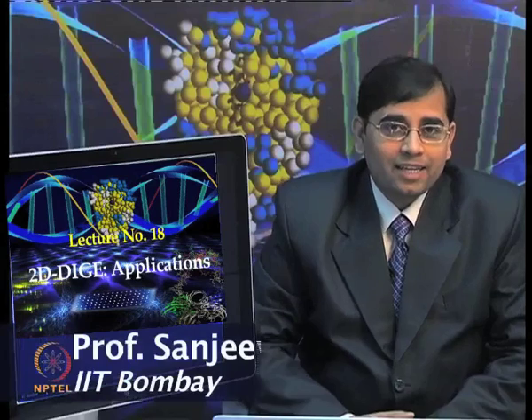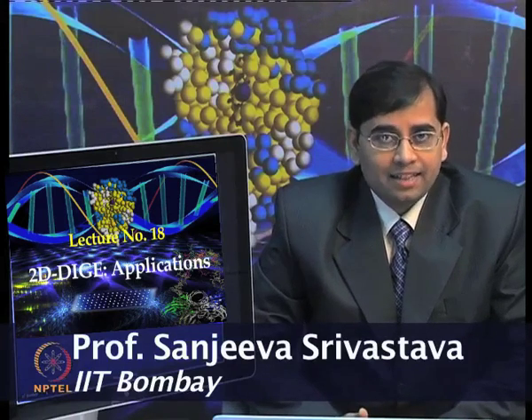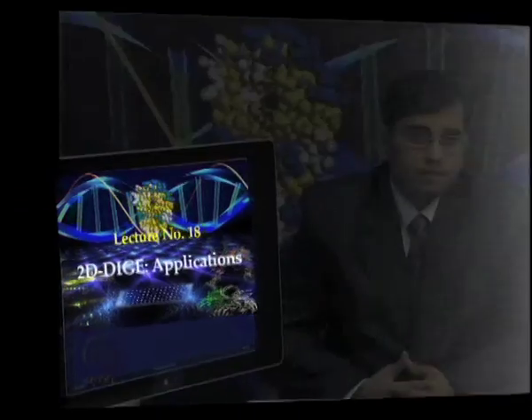So I hope our discussion with Dr. Srinivas was useful, and now you can perform these analyses by using specialized software and obtain very useful biological information from your data set. You must appreciate that there are a lot of meticulous steps involved in performing these experiments, but in the end this provides a very useful quantitative multiplexing approach to separate proteins and to analyze different types of variations.